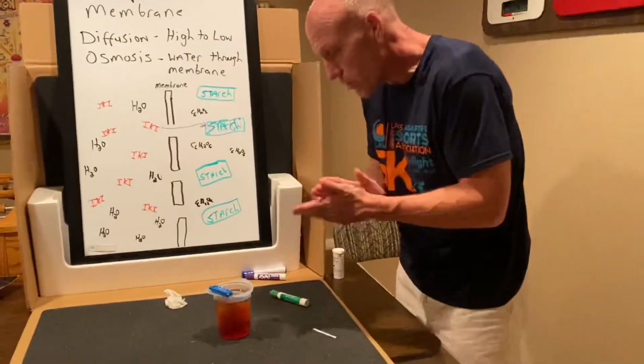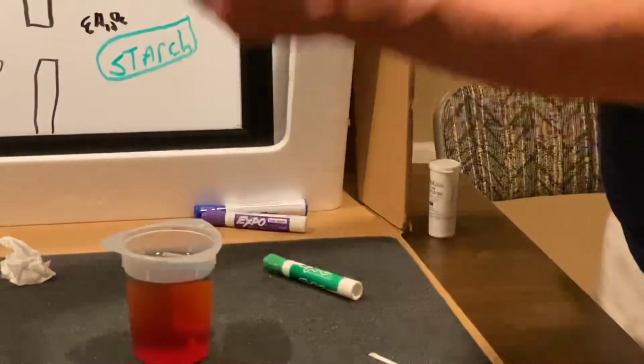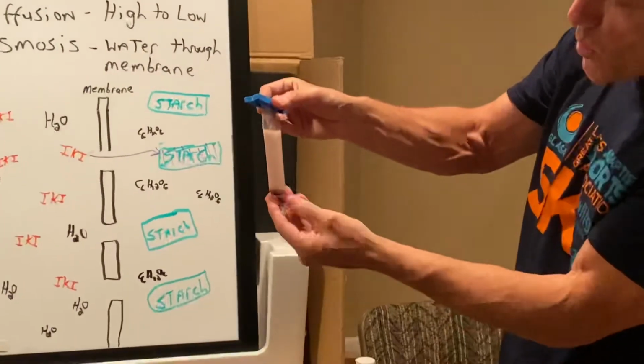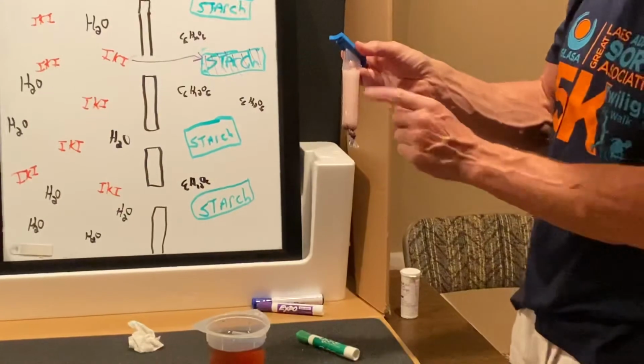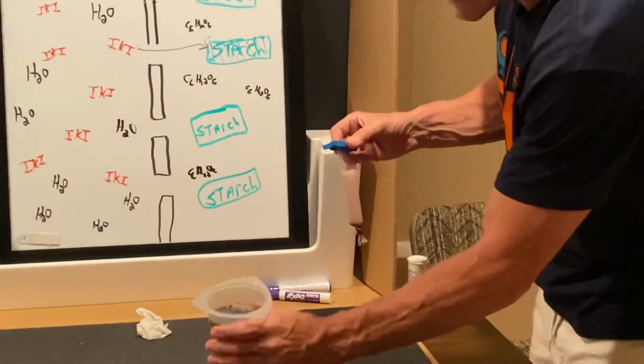Anyway, let's take a look on how our tubing's doing. Now, I don't know if you noticed, but I did the switcheroo. I took a new tubing that was already in there, and we're starting to see a purple color, especially around the knot I tied, right? What does that tell us? If the inside turned purple, and notice the outside is still brown.